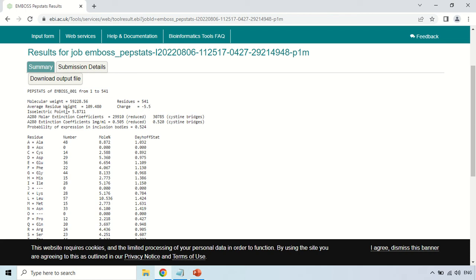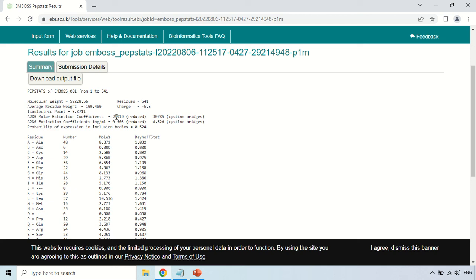This is the isoelectric point. Isoelectric point is that pH at which the net charge on the protein is zero, so the isoelectric point is 5.8711. This is the molar extinction coefficient. When they see its absorption at 280 nanometer, as all of you know that protein absorbs at 280 nanometer, so these are the extinction coefficients.